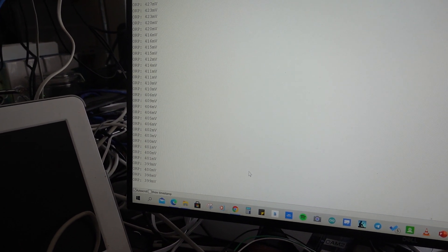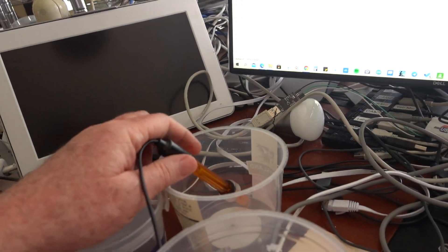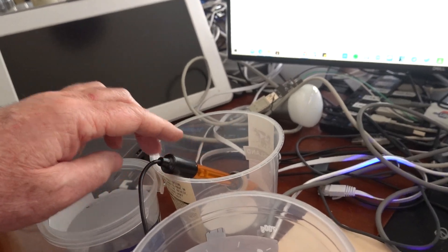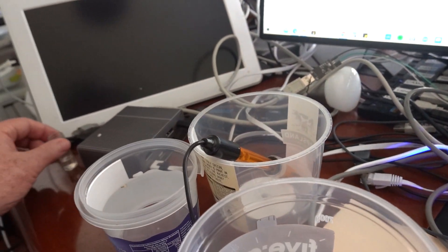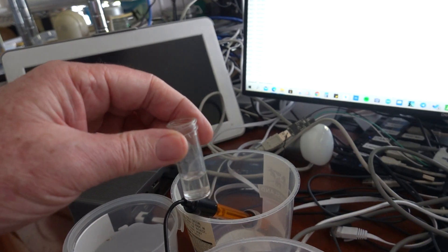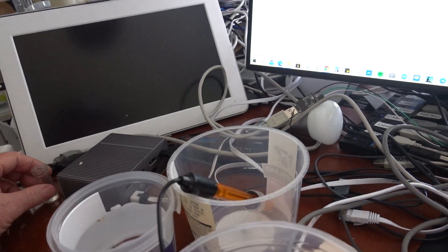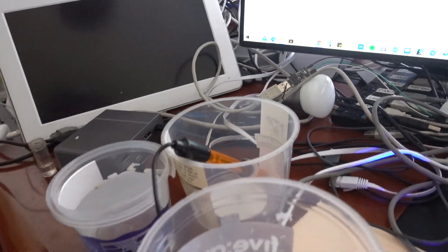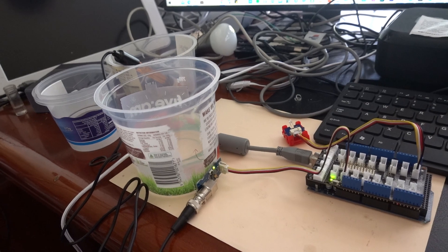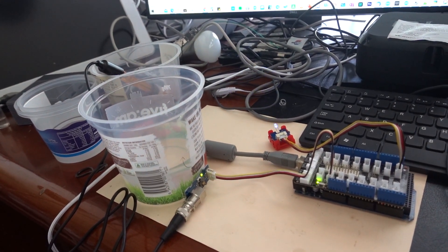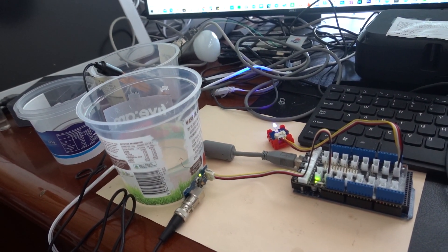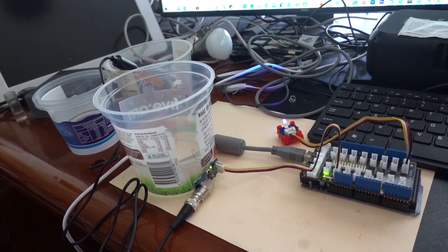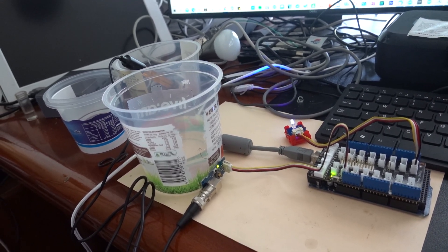We'll take it out, put the probe back into dry air, and normally we protect the probe with a special solution, which is this one. So that is the Grove ORP sensor to measure water quality.